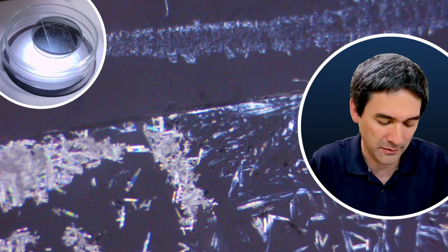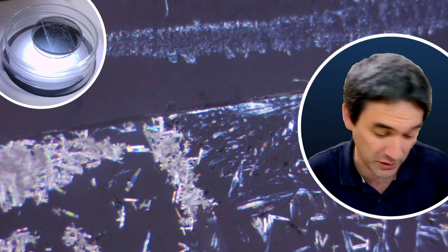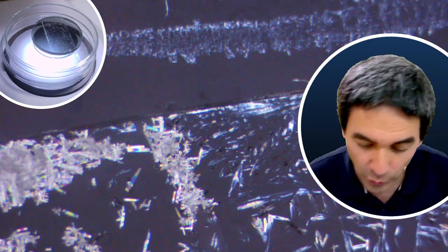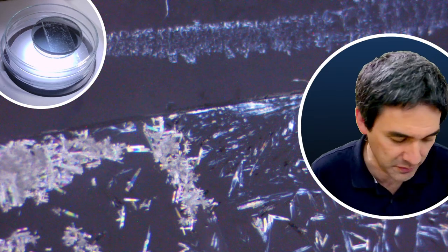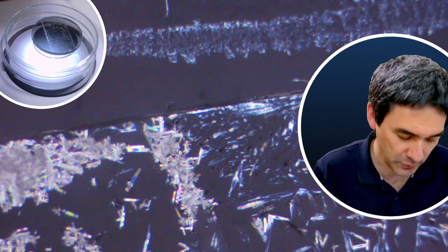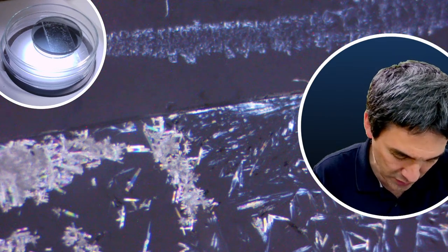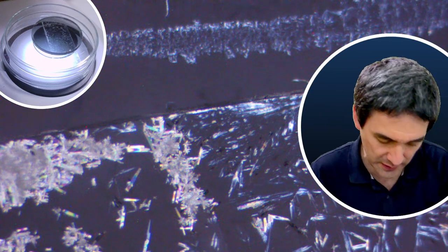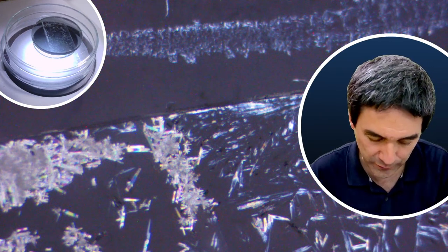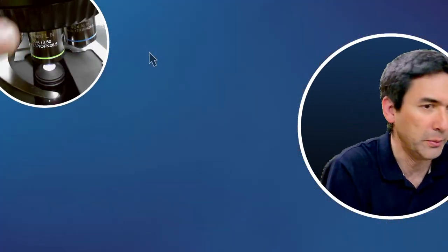And maybe just for the fun of it, maybe we just try the whole thing again, and I would like to see this now under my compound microscope, because I still have some solution left over. Where did I put it? This must be this one over here. And I'm going to put some of the aspirin solution now on here. And now, simply for the fun of it, let's have a look at this under the compound microscope.